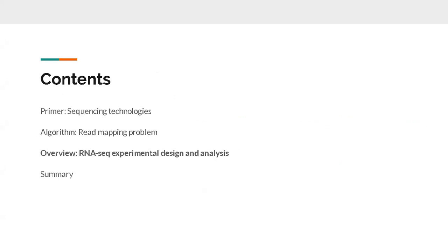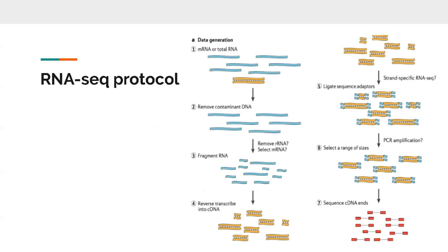So then the last part is the RNA-seq experimental design and analysis, and this will be your segue into the RNA-seq analysis, which we will be doing in the next class. So I'll just quickly take you through the protocol once again. It is almost the same as what we saw in the video, except for a few minor changes.